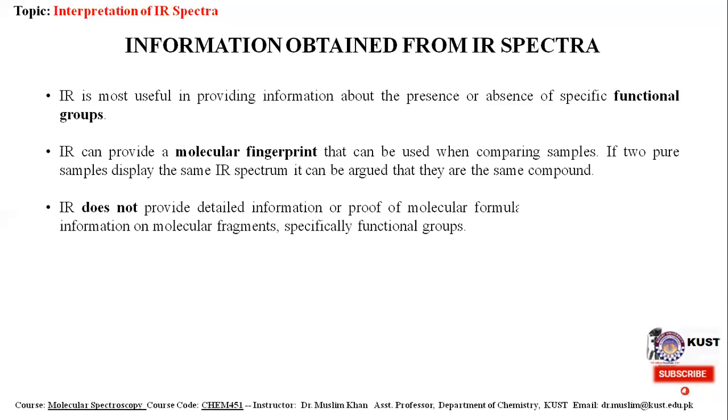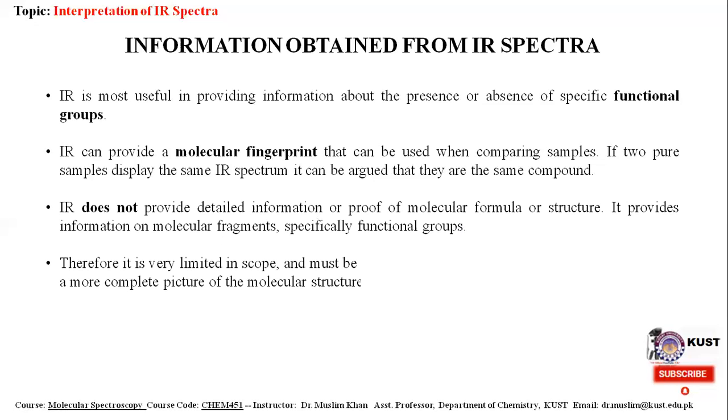IR does not provide detailed information or proof of molecular formula or structure. It provides information on a molecular fragment, specifically functional groups. Therefore, IR spectroscopy is very limited in scope, as I told you in my earlier lecture, and it must be used in conjunction with other techniques to provide a more complete picture of the molecular structure.